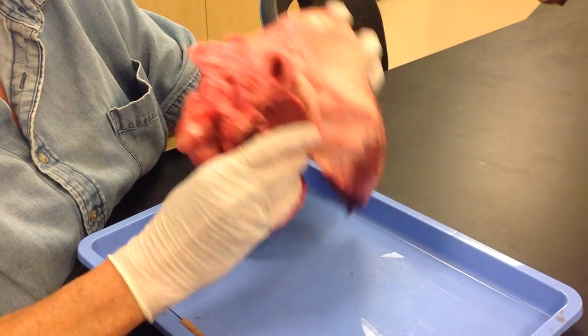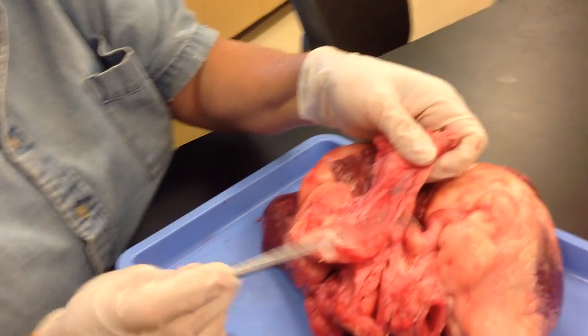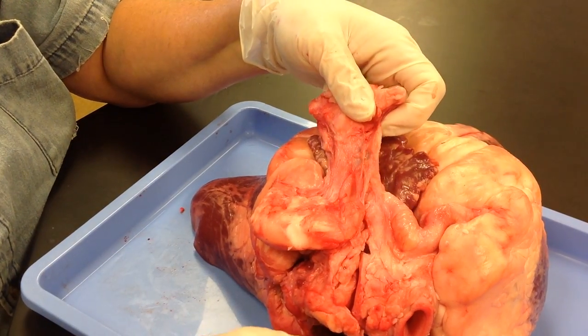The pericardium is not on this heart — here's part of it here. Remember, peri means around the heart. We did have a deer heart that showed the full pericardium.